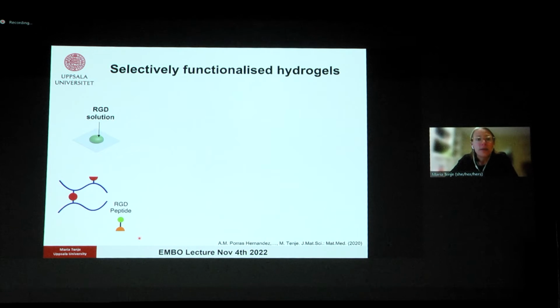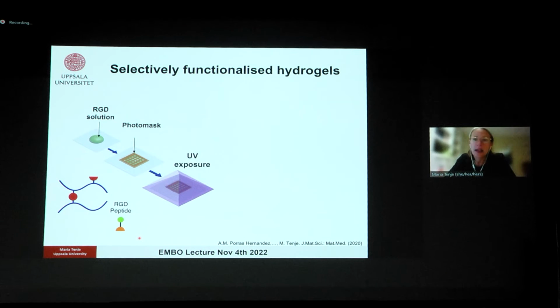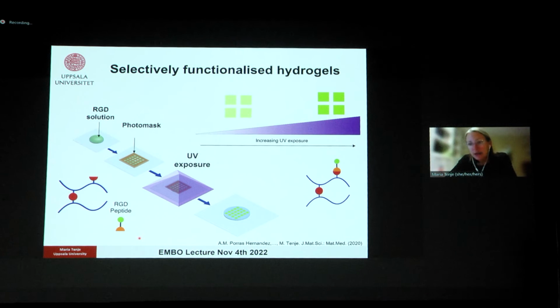And again, we exposed to UV light, but this time through a photomask, where some areas are open to the light and some are blocked. And in that way, we could generate a pattern of functionalized hydrogel. So the RGD then bound to these acrylamide groups in the areas exposed to UV light. By increasing the exposure dosage, we bind more RGD to the scaffold.